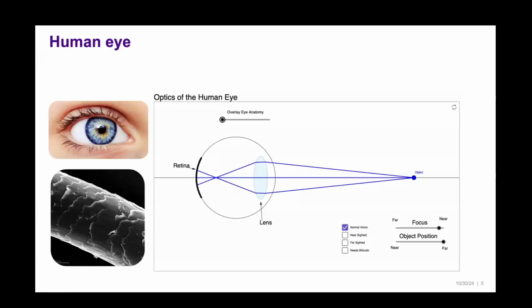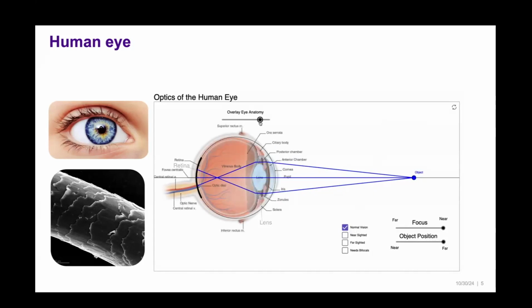So before we go, many of you know the human eye. That's how we can see, you know, the physics behind this or biology behind this, which is very complex. But the most important for us is the lens and retina and the object, where this object is placed. Now, depending on the size of the object, distance of the object, and the visualizing angle, you are able to see an object very clearly, or you are not able to see it.